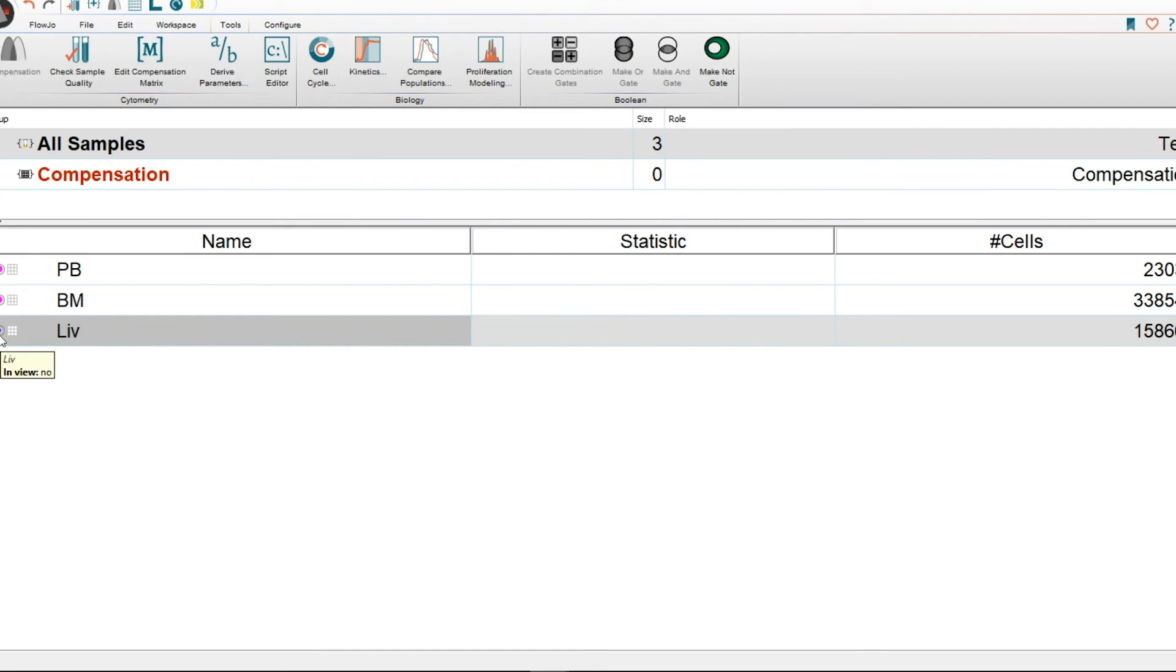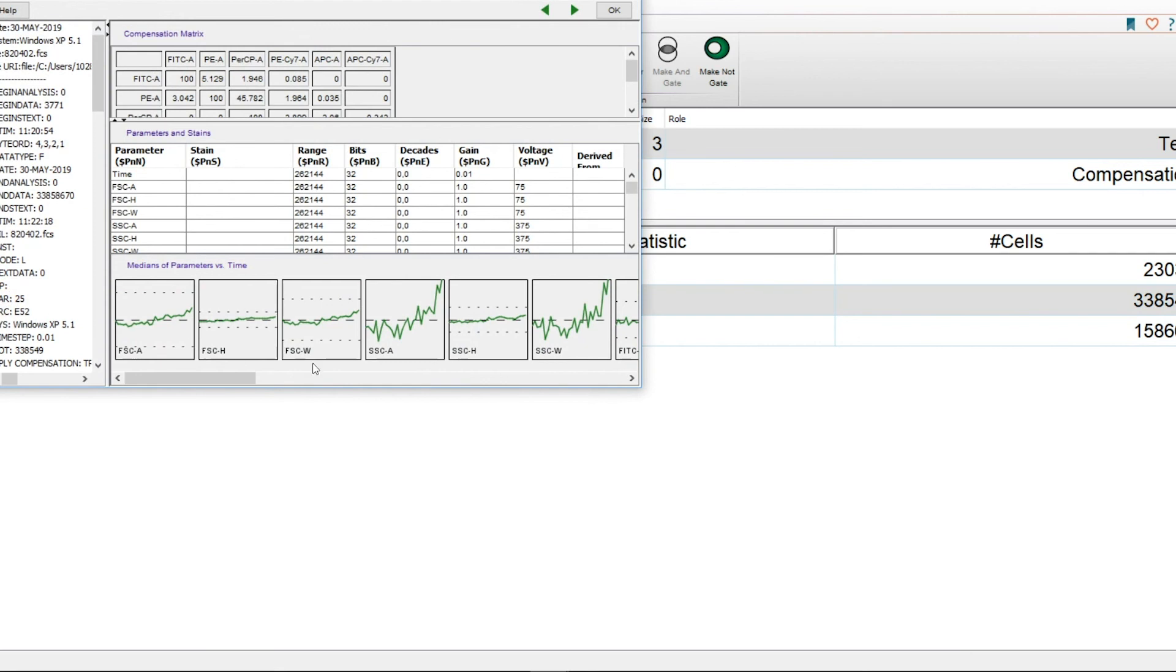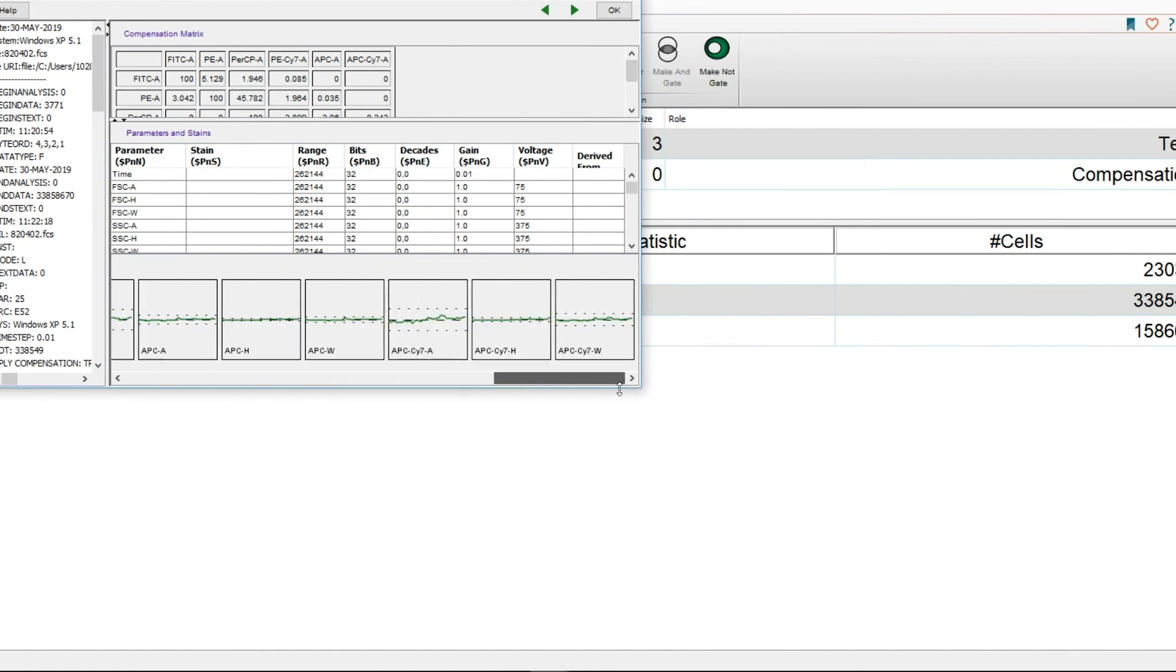Well, let's look at a sample that looks poor. Let's double click the badge for this sample, and there we can see, for example, on side scatter area that the spike is quite severe. If we look at it across the board, we see that that was the most severe as well with side scatter width.